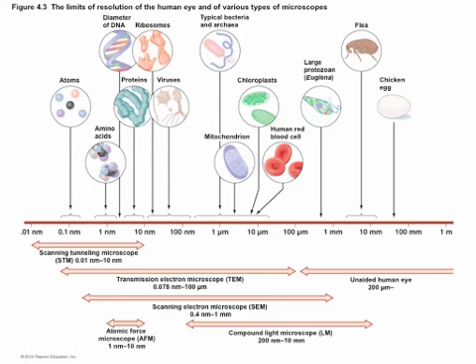So compound light microscopes can go all the way from fleas and insects, through protozoa, human cells, organelles, down to bacteria. The smallest bacteria are right at the edge of what you can see with the compound light microscope.